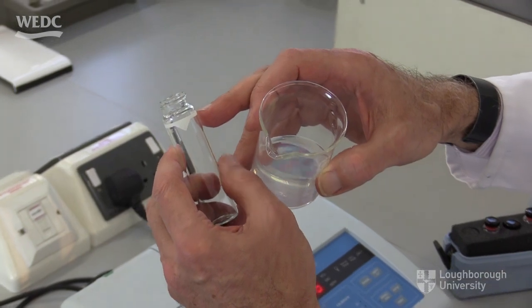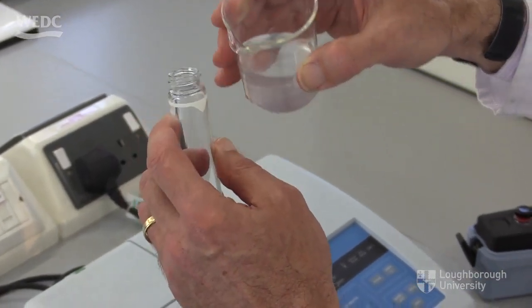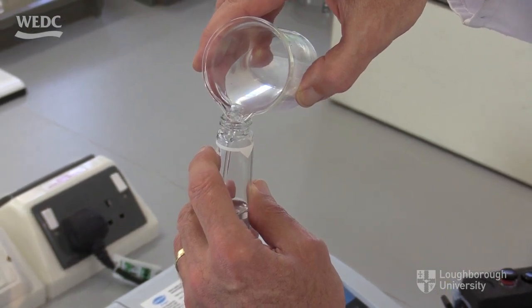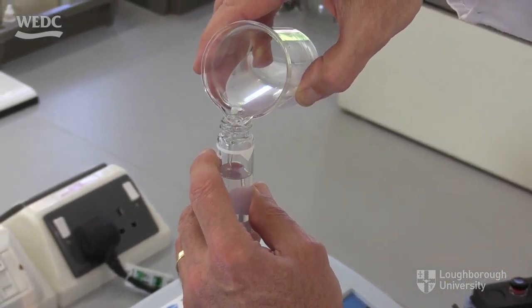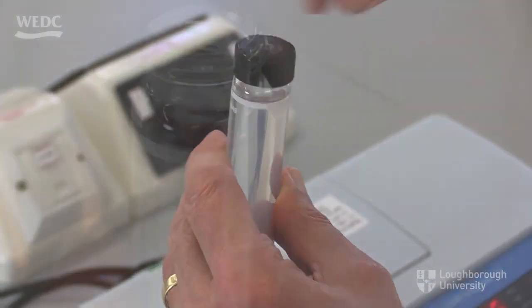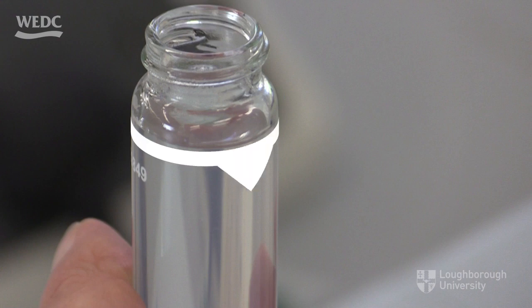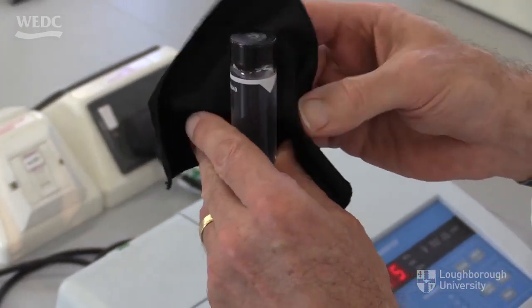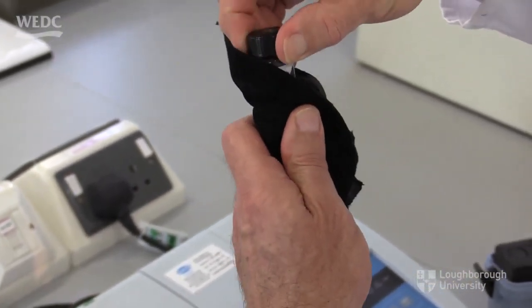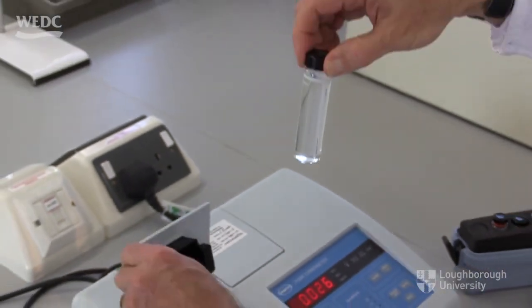Here you take a sample of the water to be tested, placed into a tube designed to fit snugly into the machine. Fill the tube with the turbid water up to the white line near the top of the tube and screw the cap onto the top of the tube. There is a small white triangle on one side of the white line. This triangle should point towards you when the tube is inserted in the turbidity meter. Next, clean the exterior of the tube, as you want to measure the turbidity of the water and not the cleanliness of the glass tube.